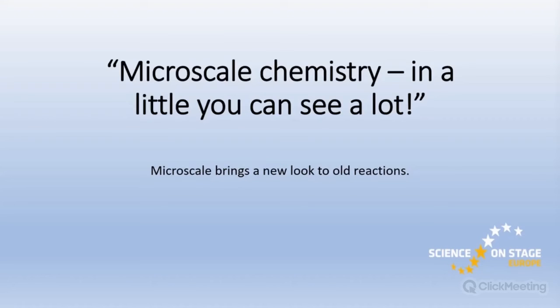I love the little flame test. It's really nice. Now, let's have a look at some old reactions and give them a new look.